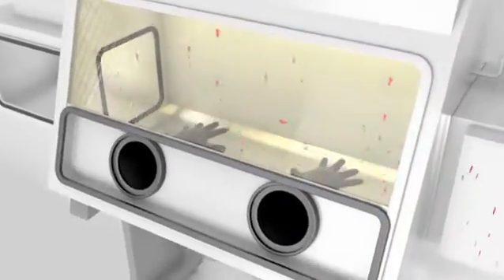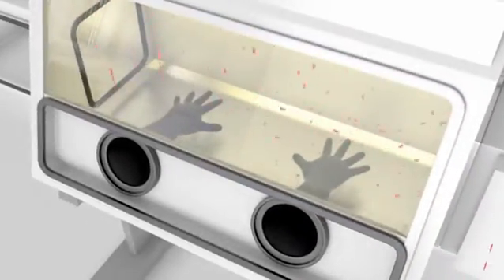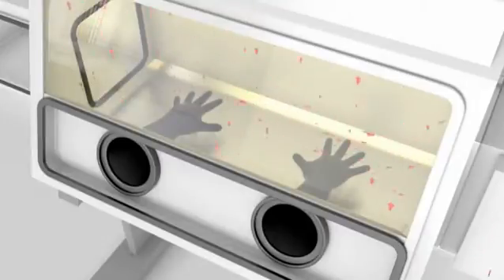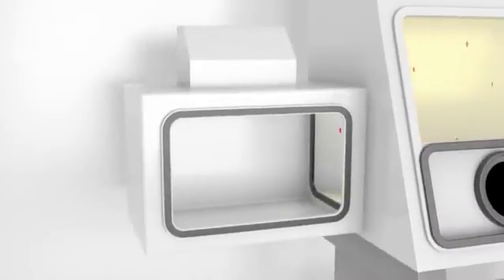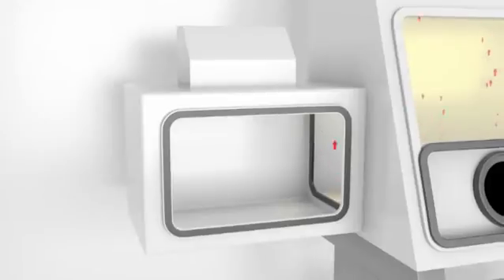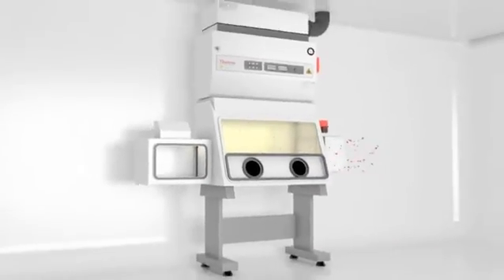Access to the work surface is by means of heavy duty rubber gloves attached to ports in the cabinet door. The class 3 cabinet has a pass through box attached that can be sterilised and equipped with a HEPA filtered exhaust or a double door autoclave can be connected for the decontamination of all materials entering or exiting the cabinet.